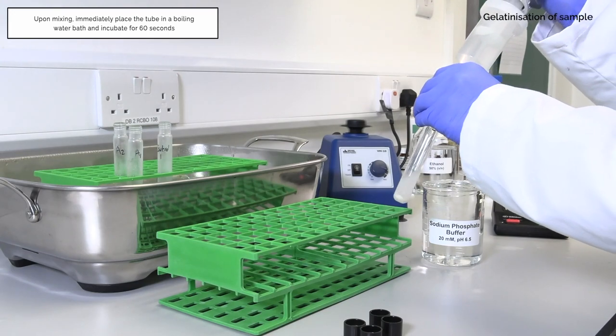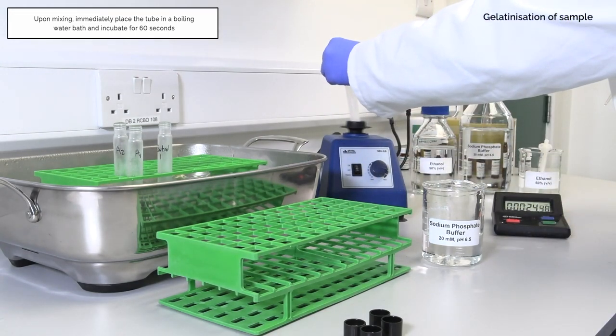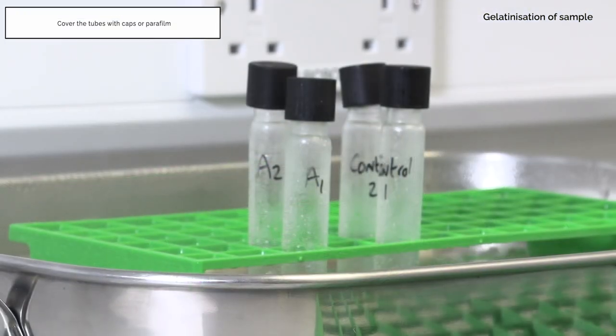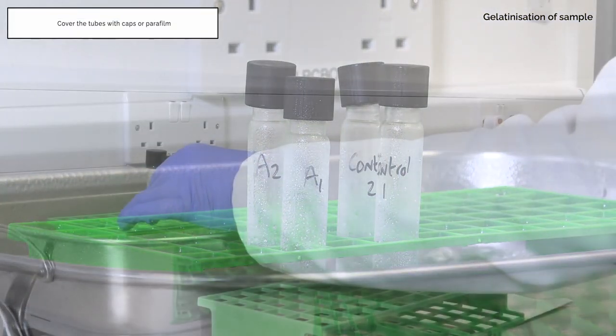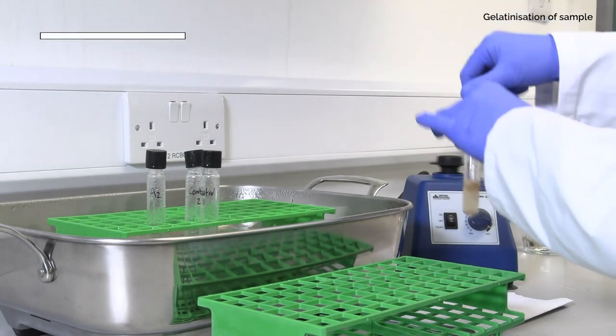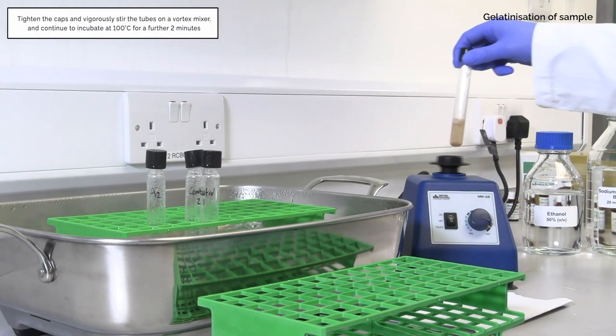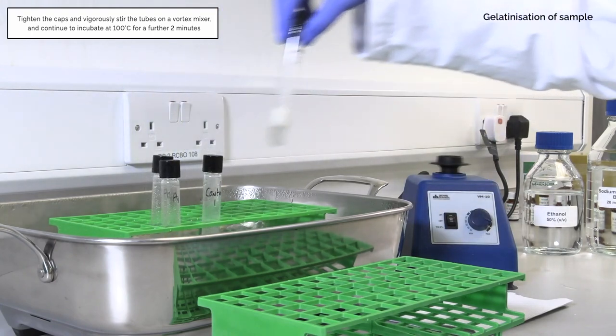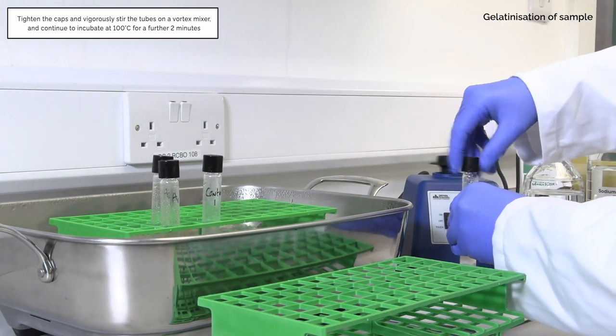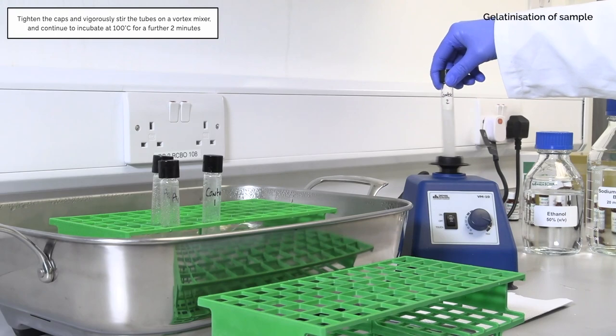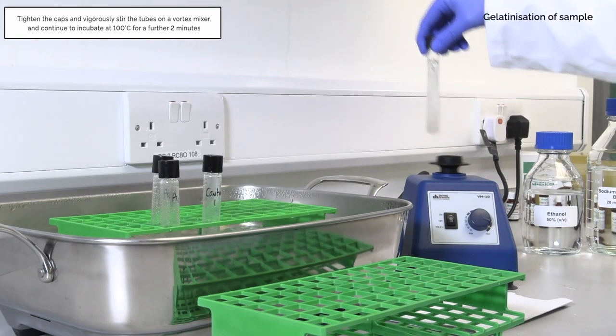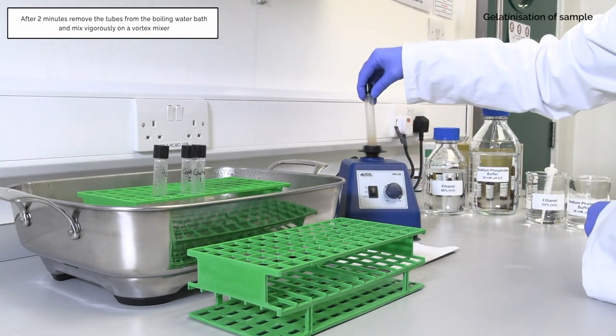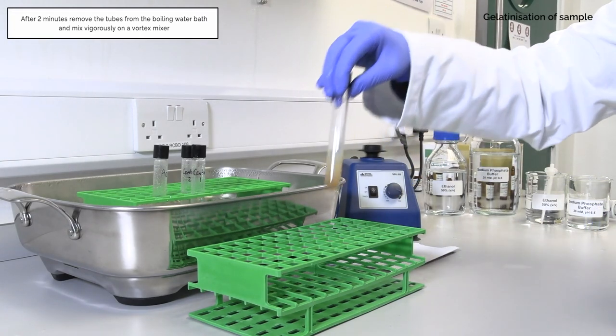Upon mixing immediately place the tube in a boiling water bath and incubate for 60 seconds. Cover the tubes with caps or parafilm. Tighten the caps and vigorously stir the mixture on a vortex mixer, and continue to incubate at 100 degrees Celsius for a further 2 minutes. After 2 minutes remove the tubes from the boiling water bath and mix vigorously on a vortex mixer.